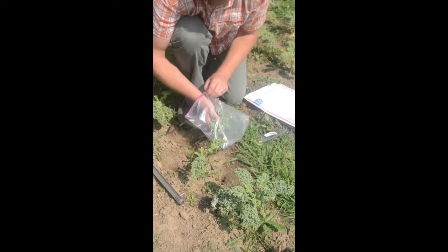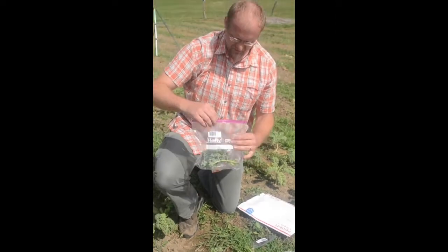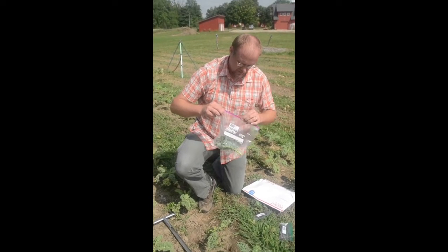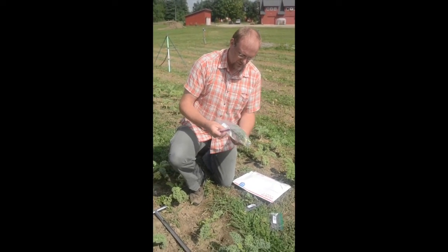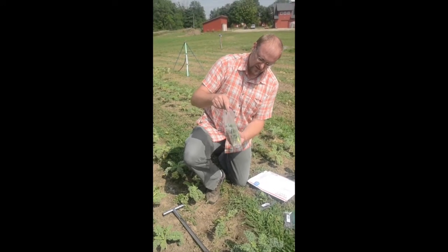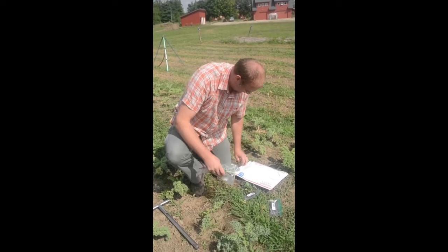I'm going to put them in the bag. And this is important: when you close the bag, you don't want to squish all the air out, because if you squish all the air out, the samples tend to start to rot when they're in shipment. So if you leave that air in, you don't have to blow air in, just leave the natural air in there. Now it'll ship much better.